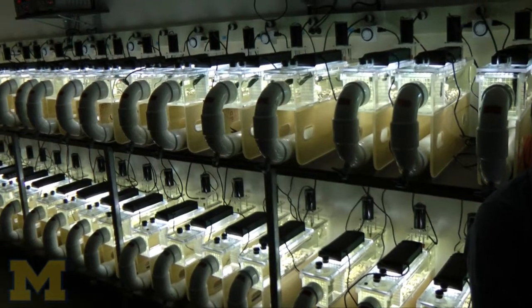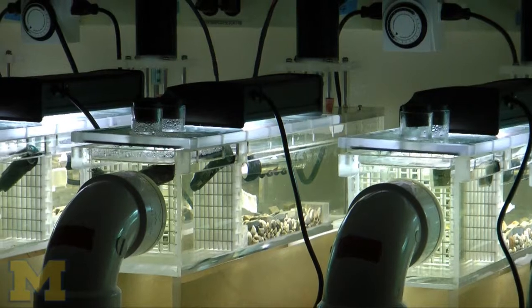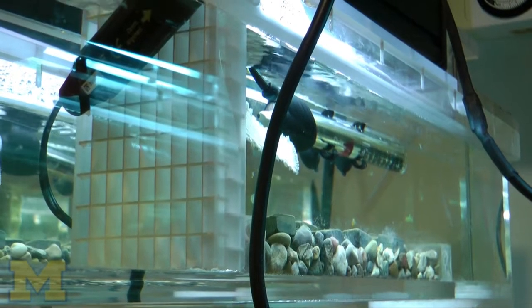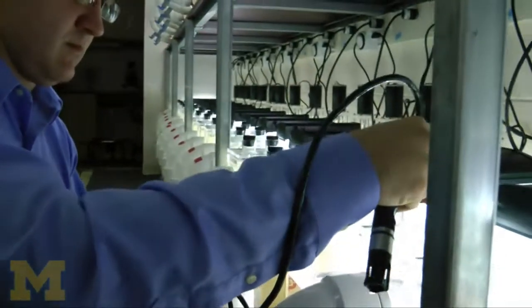This is a lab where I basically study environmental problems as they relate to freshwater habitats like streams and rivers. And this particular facility that we're looking at right now has 150 what we call flumes, which are artificial streams. We are taking pieces of the Huron River right from our backyard, and we are taking the bacteria, the algae, and the small invertebrates that inhabit that stream, and we're putting little pieces of the Huron River in 150 of these streams. And then what we're doing is we are imposing treatments, stresses that the Huron River is currently facing, such as nutrient pollution, chemical pollution, erosion, invasive species, loss of biodiversity.